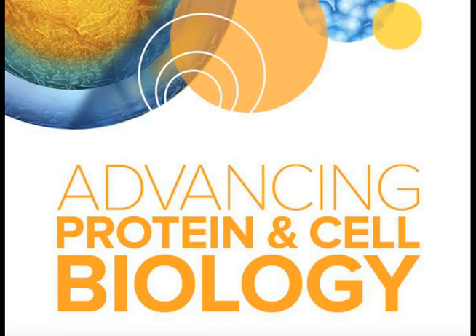I'm not sure, Steve, were the mitochondrial assays taken at 20 or 40x? I believe these ones were 60x. 60x, okay. It really depends on the assay and what you're trying to see, what mag and what objective you would use. It just happens that Oksana's were done at lower mag.